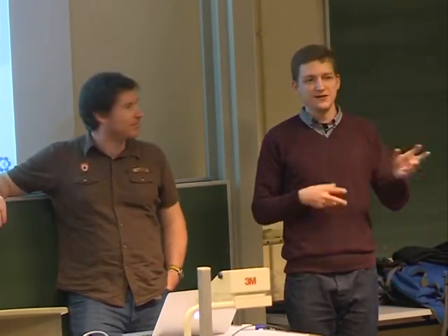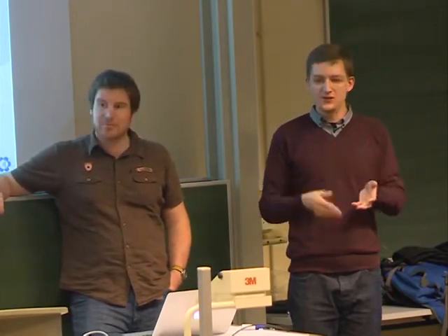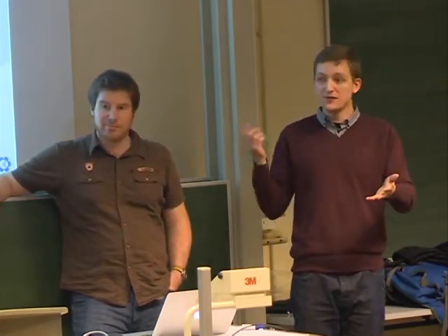Do you have some example of scripts or of people doing, for example, machine learning on your platform? I'm actually working on it right now. We have a repository for user provided scripts. So if someone says, I came up with this really nice way of phenotyping cells or working with images, they can just come to us or open a pull request on GitHub. We can then review the code and it will be available to the whole community, especially if it's a high quality algorithm.